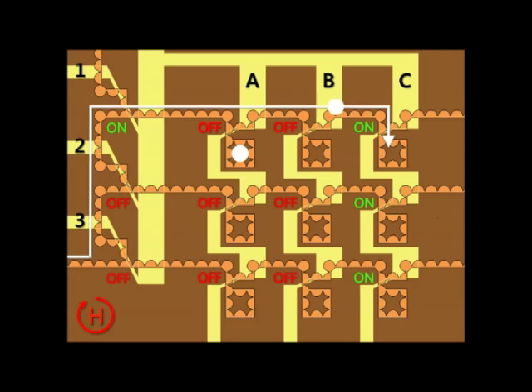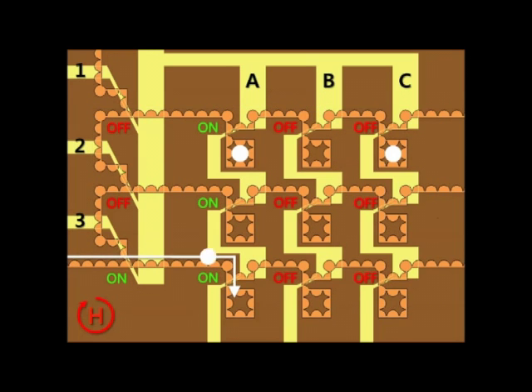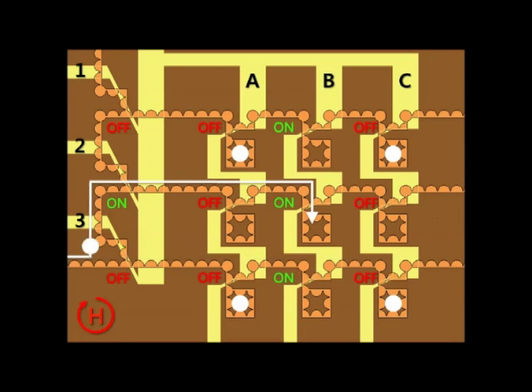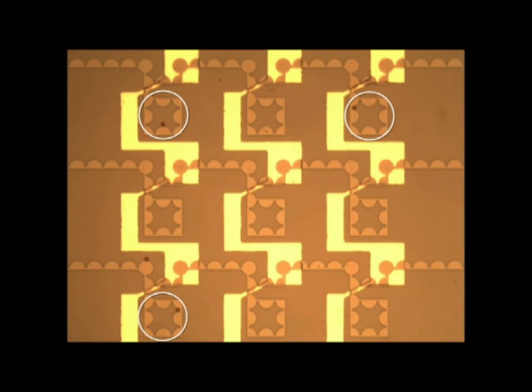We have a three by three array where we have three row switches and three column switches and in order to demonstrate an arbitrary pattern we form an X as you see here where we put five beads into an X pattern.